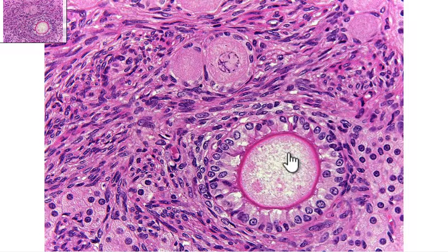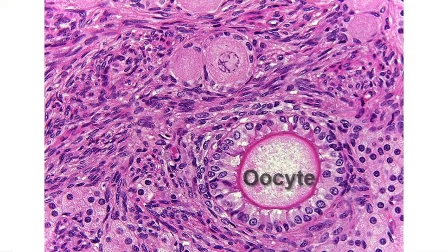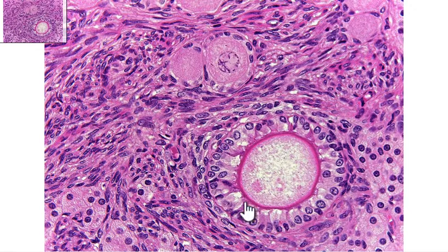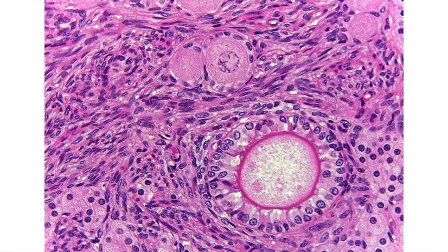And then inside, this will be the oocyte being prepared or matured. Because when you get to the primary follicle stage, you're at that point where they're starting to be matured for potentially allowing for fertilization later in the cycle. So this is your ovary, your primary follicle.